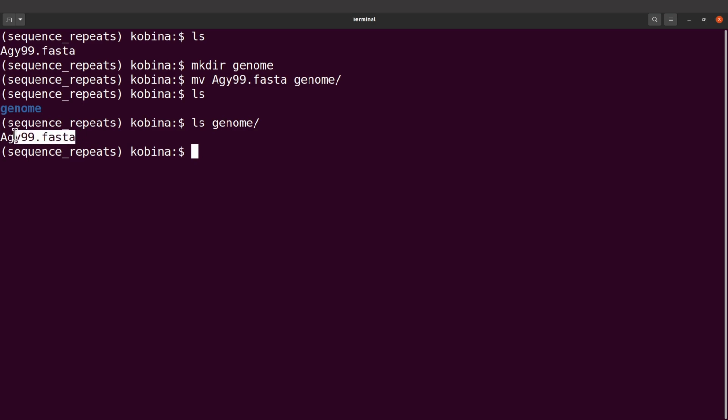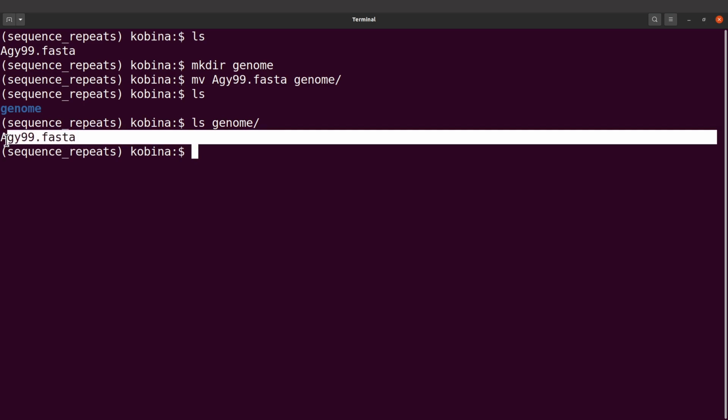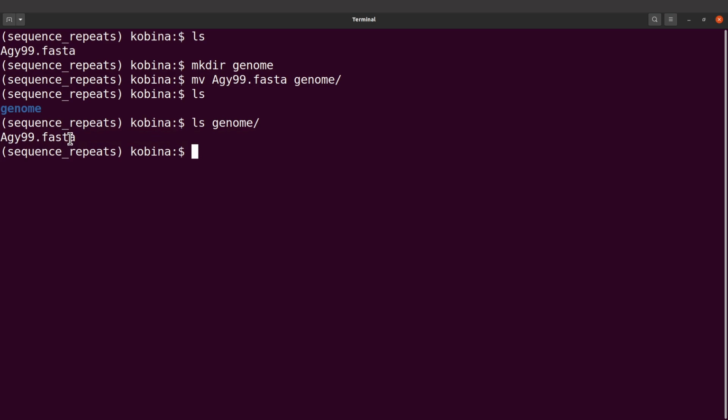Now this is a nucleotide sequence. With blast, the database that you create, you need to specify the type. I'll show you all that anyway, but just note that creating a blast database for protein sequence is different from creating a blast database for nucleotide sequence. But what we have here is a nucleotide sequence, so I'll show you how to do that. Again, let me go over. I now have my sequence data, which is nucleotide sequence. So I'm going to generate my blast database.